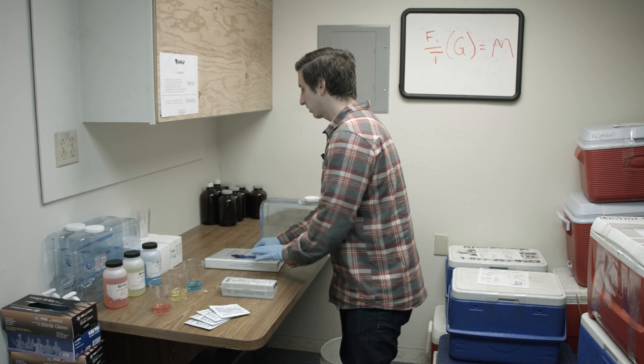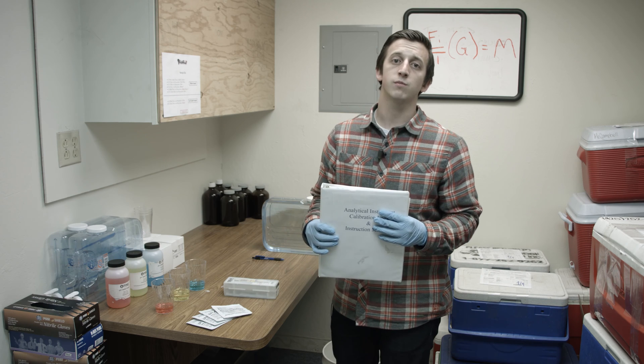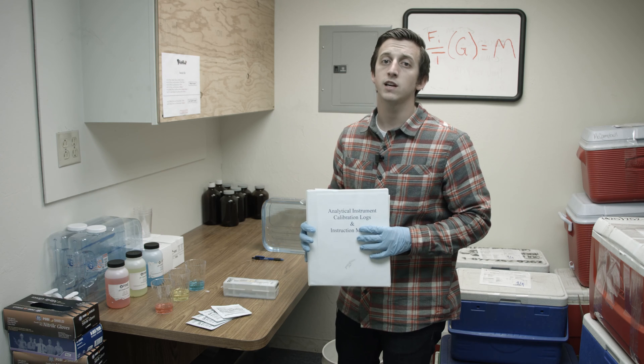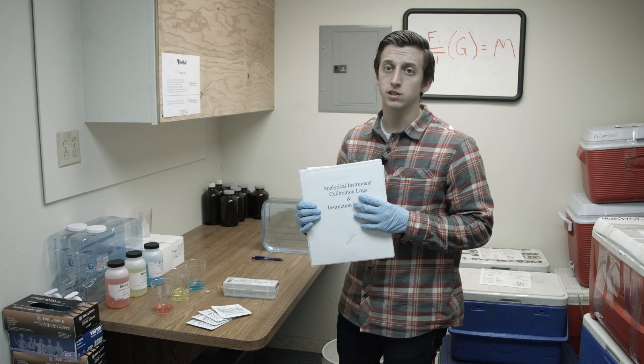Now that you know when to calibrate, let's talk about calibration logs. It's important that you record all the information in a calibration log because the industrial general permit and the construction general permit both mandate that you keep a three-year record of all calibrations done on each device.